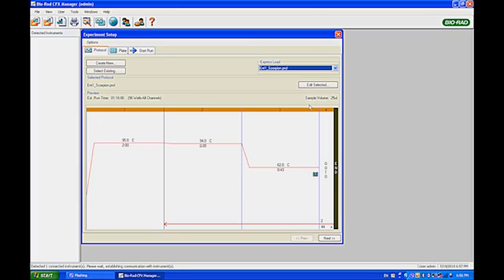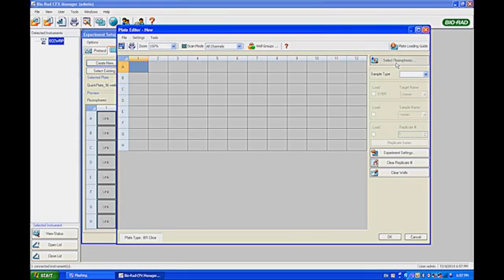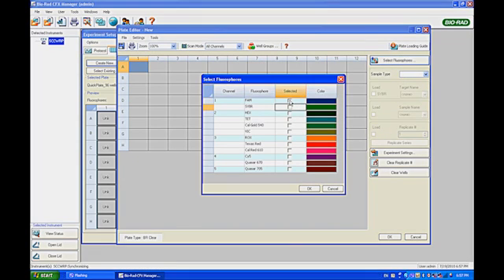This sets the cycling parameters to 95 degrees for 2 minutes, followed by 45 cycles of 94 degrees for 5 seconds and 62 degrees for 43 seconds. Next, define your plate setup by identifying sample type and assay in each well on the plate editor screen.